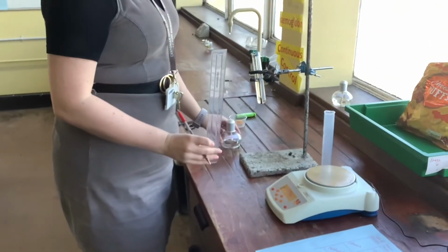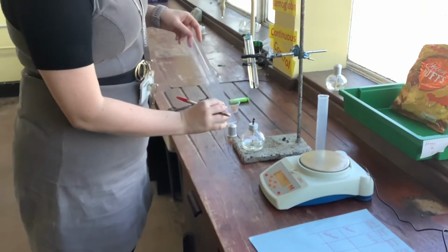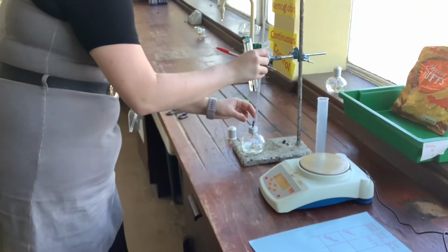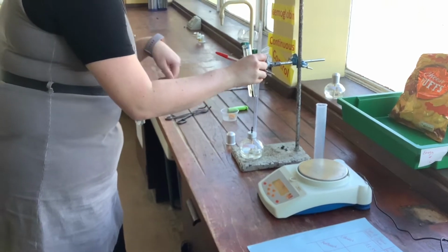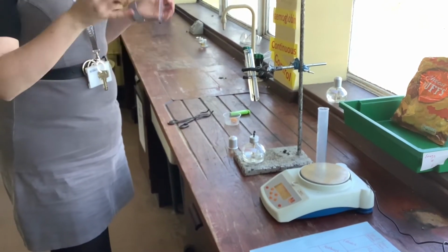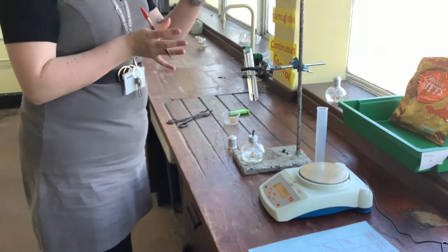Next thing we're going to do is place it underneath. Take off your cap and record whatever measurement you are going to use. You need to use exactly the same measurement between the wick and the bottom of your boiling tube. So this one's 95, so when we do the other alcohol, we need to do 95 as well, to make sure it's accurate. That's a control variable, and that's how you control it with a ruler.